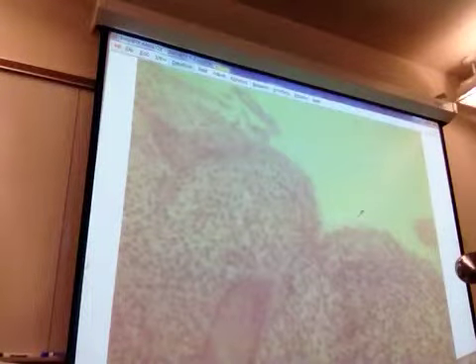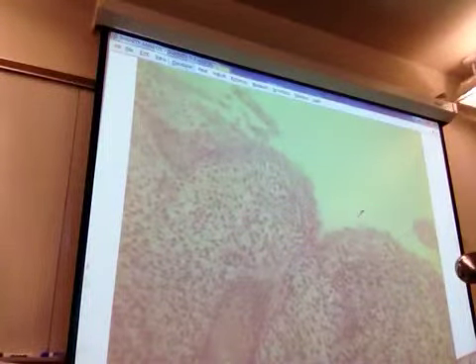That looks columnar. Is there histology of the uterus section? There is, and it lists it. I believe it is also in my PowerPoint presentation, which is why I'm making you look it up. Look columnar. Yes, very good. What's the answer? Simple columnar. No, wait, let me check it.